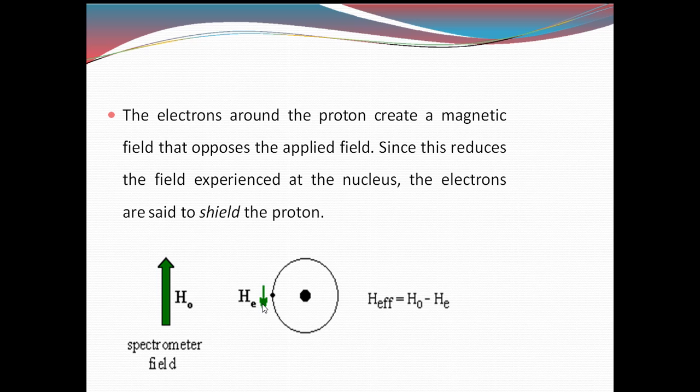So you have to vary the magnetic field so that the protons which are shielded will be differentiated at a higher strength of magnetic field, and the protons which are de-shielded will obviously be differentiated at a lower strength. Is it okay? So I think you people got the idea. So what is the need? If the proton is more shielded, you have to provide a large amount of magnetic field so that it will differentiate the spin states. Whenever it differentiates the spin states, only then will it absorb the NMR, that is the radio frequency region. That is very important for our molecule.